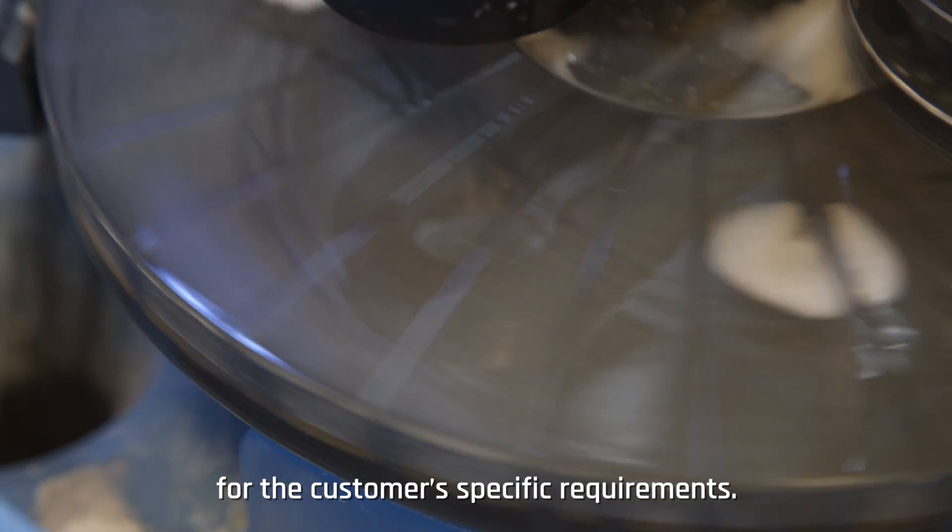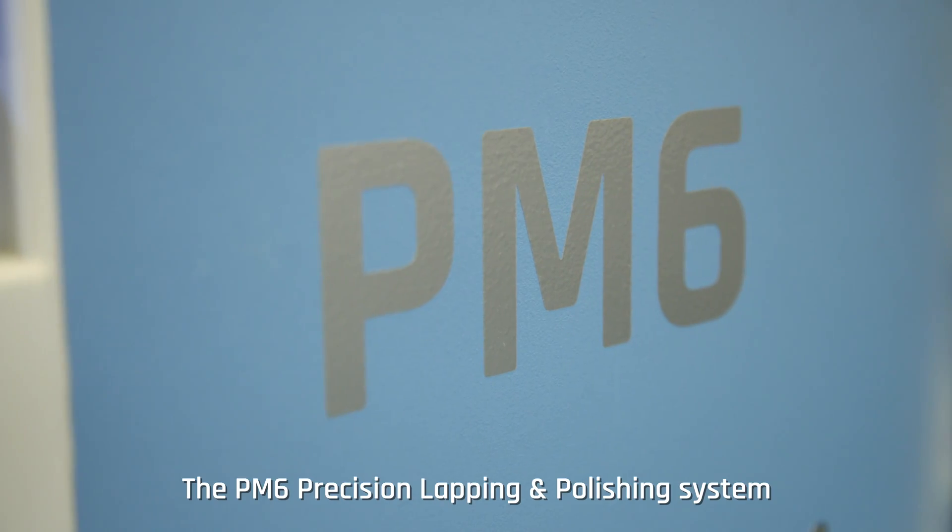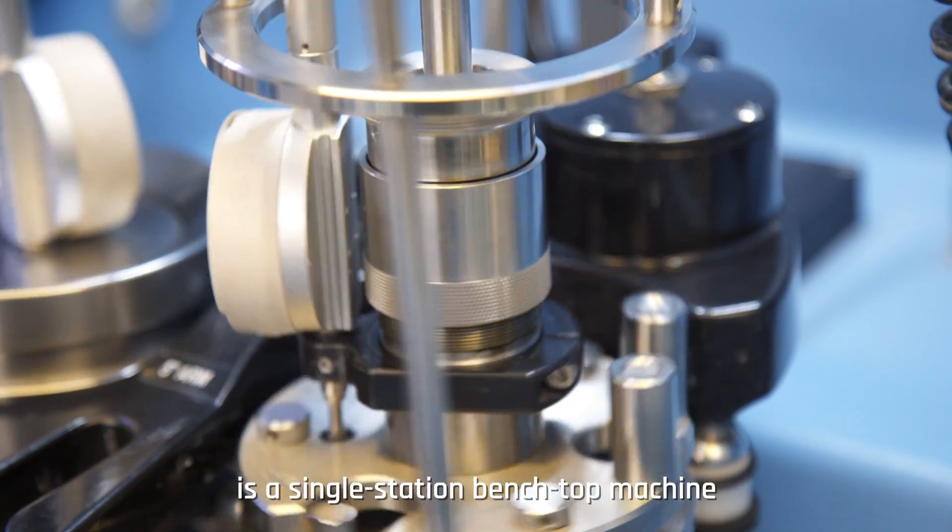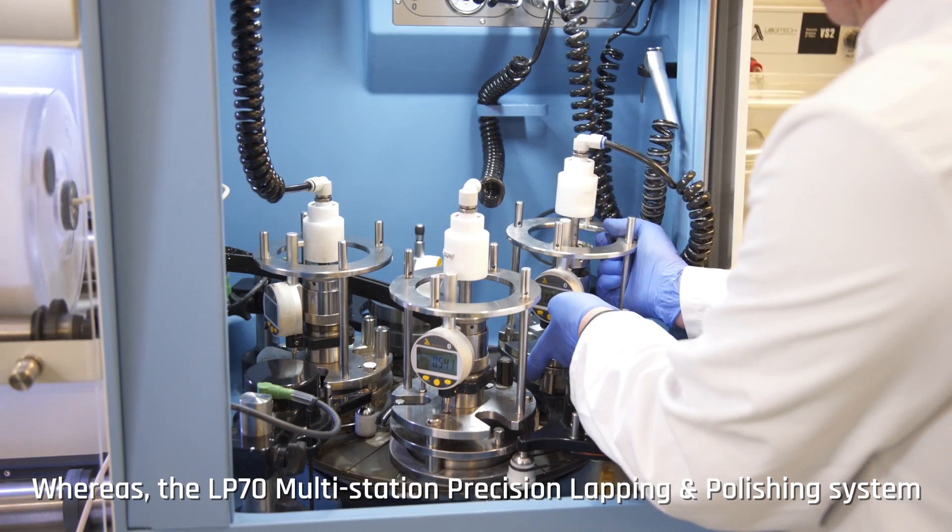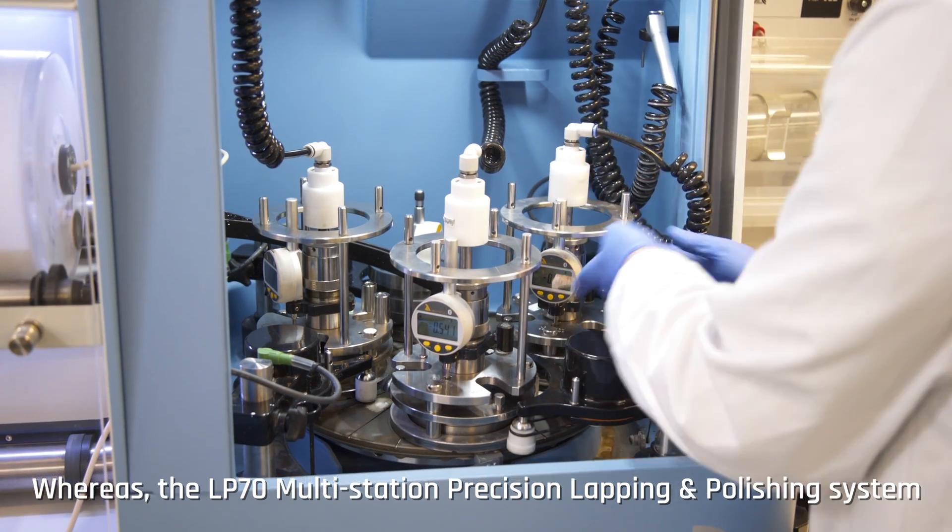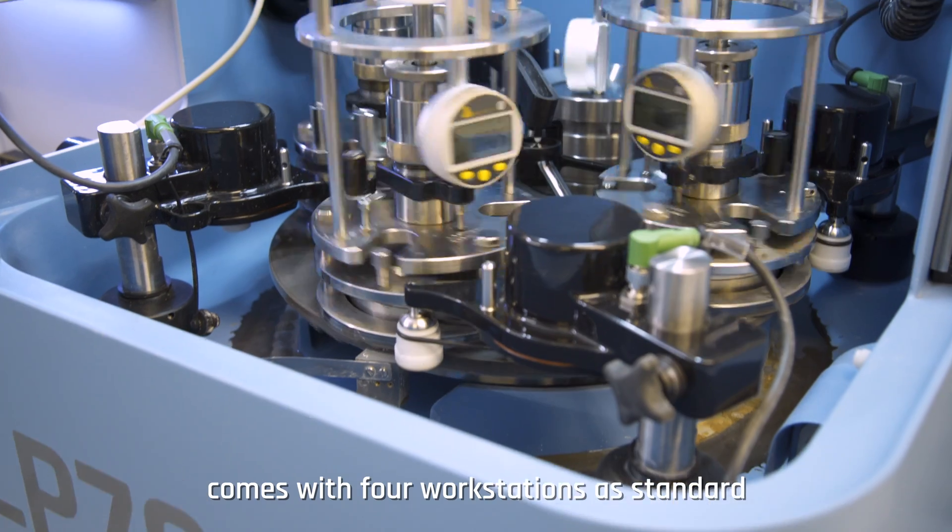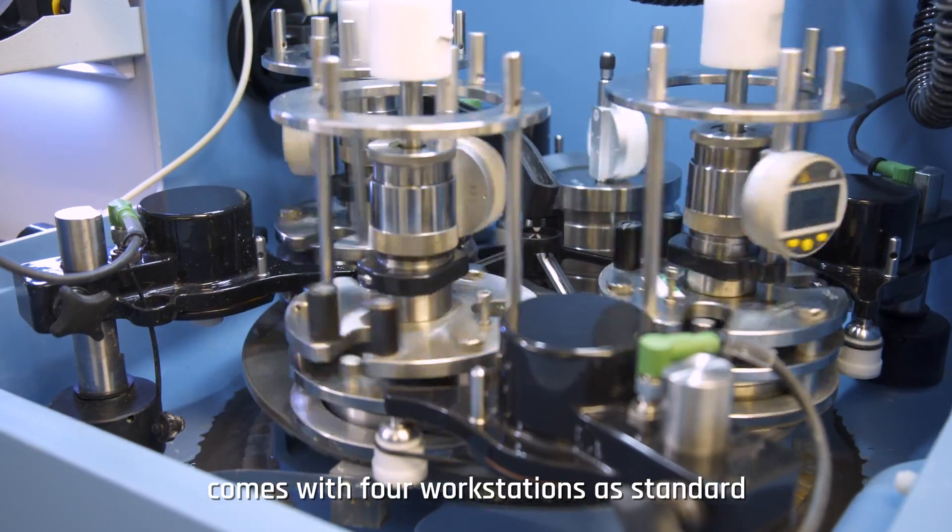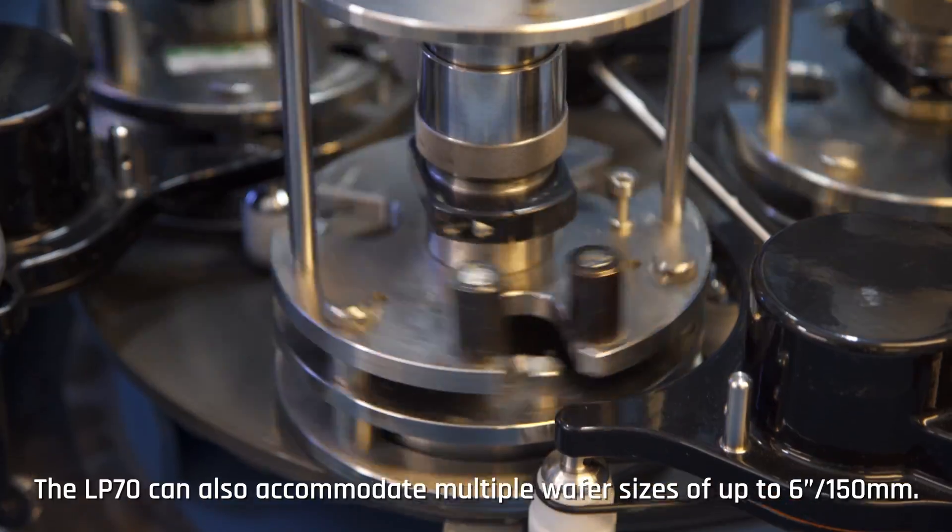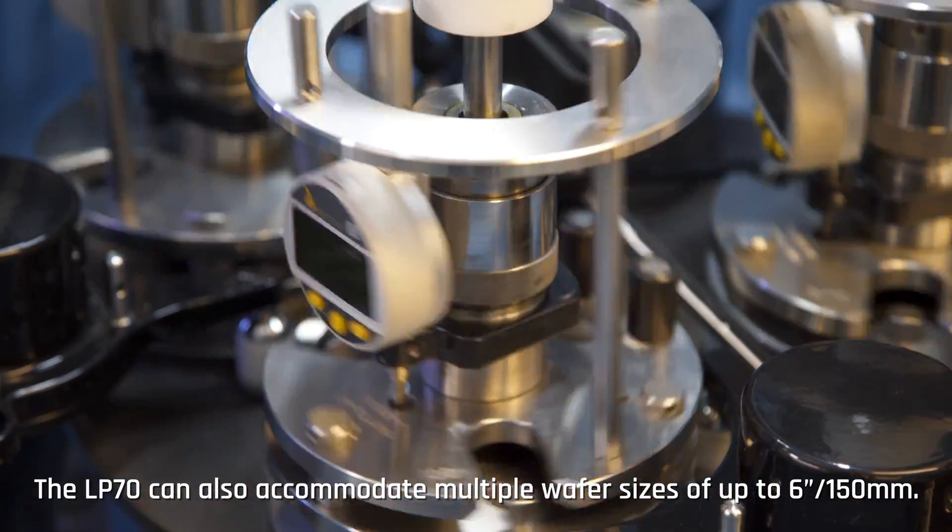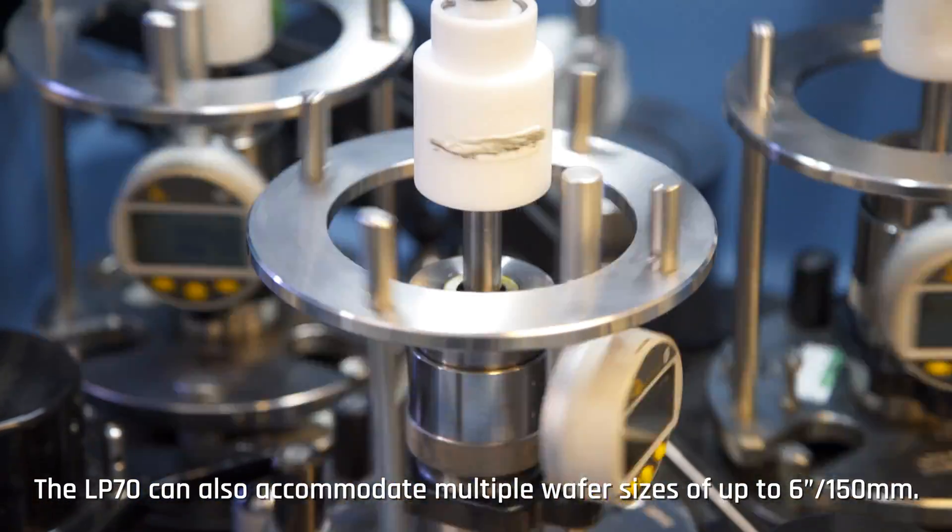The PM6 precision lapping and polishing system is a single station benchtop machine with a wafer process capacity of up to 100 millimeters, whereas the LP70 multi-station precision lapping and polishing system comes with four workstations as standard, allowing for the process of multiple samples simultaneously. The LP70 can also accommodate multiple wafer sizes of up to 150 millimeters.